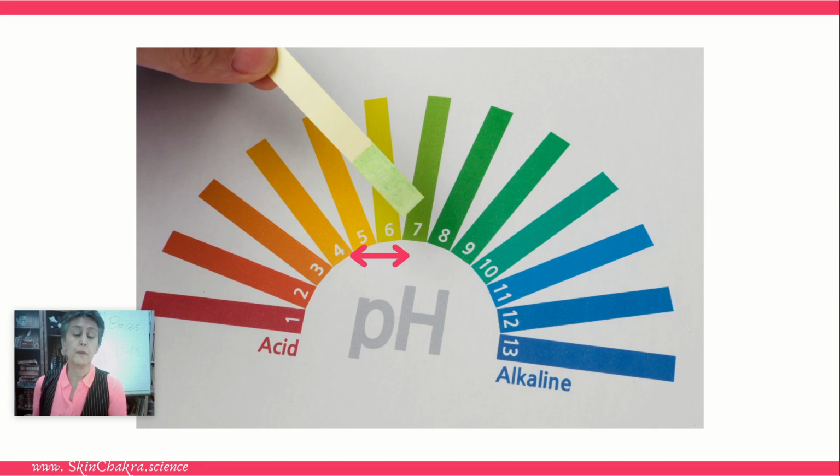What is the range? It depends on the product type, on the application, on the consumer. Obviously, a baby product has another pH range than a sunscreen or a hair dye or an AHA cleanser. For most of the daily use products, the pH is between 4.5 and 6.5, but for products such as sun care, hair dye, or chemical peelings, the pH is much higher or much lower than this range, and you need to adjust the pH to guarantee the efficacy and the safety of the product.